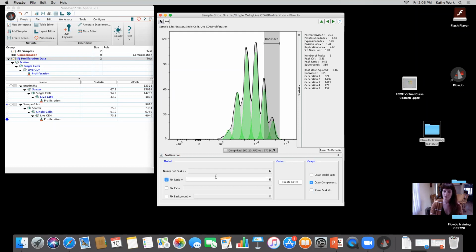So I'm going to select here to fix the ratio, and I'm going to set that to 0.5. So I always want you to be on the lookout for that. Now, when I do that, what do we see?